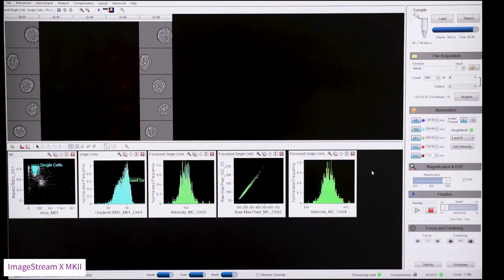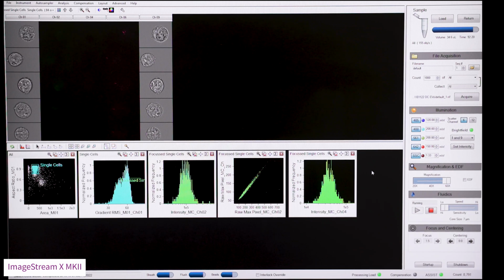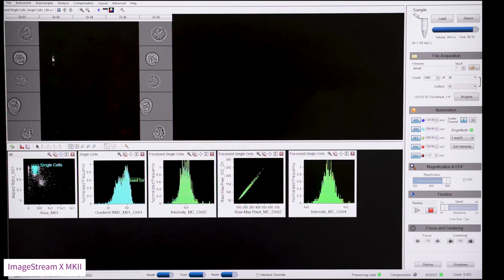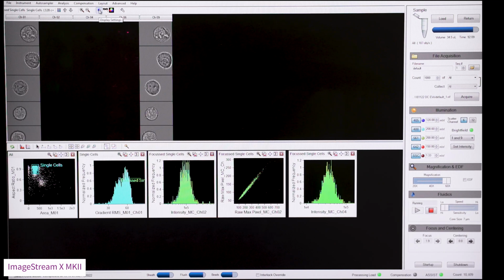You may notice that we're not seeing any green looking cells. The appearance of the images isn't actually important in capturing the data and can and should be adjusted in analysis later. However, so we can see what the cells look like as they pass through the machine, we can adjust the display settings by using the button at the top left of the screen.